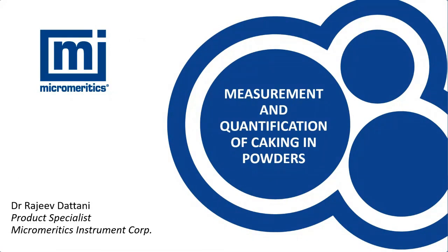Hello, thank you for joining me today. So we're going to talk today about measurement and quantification of caking in powders. So how can we measure powder caking, and how can we start to quantify it?